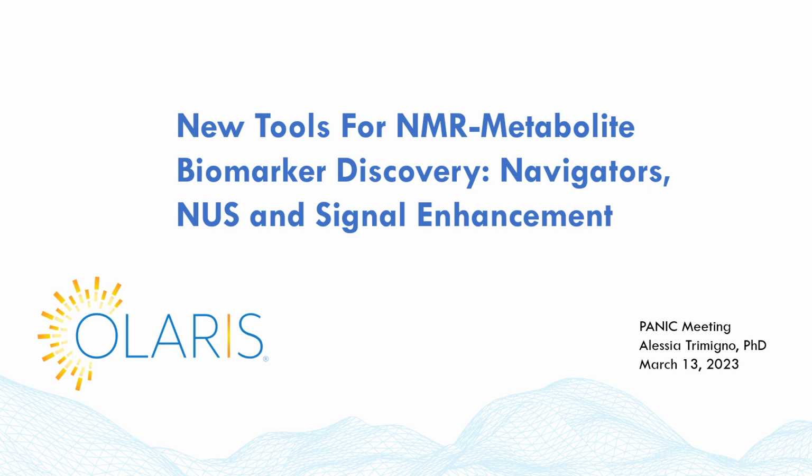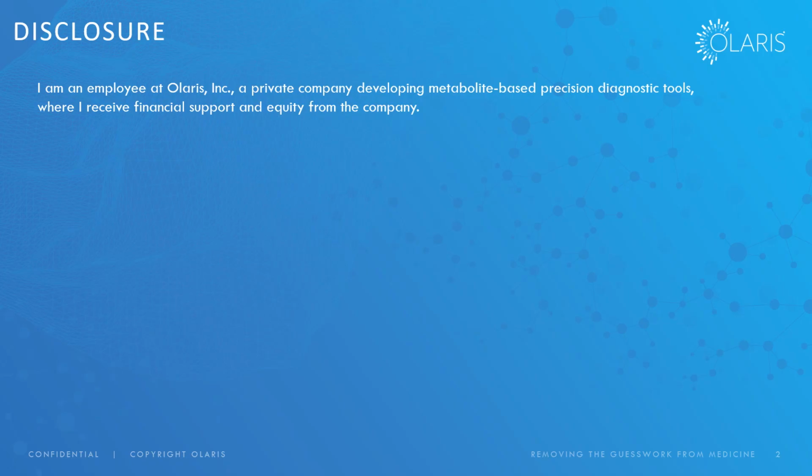Today, I want to talk to you all about new tools for NMR-Metabolite Biomarker discovery, which are Navigators, NUS, and Signal Enhancement. My name is Alessia, and just as a disclaimer, I work at Olaris, which is a private company from which I get both financial support and equity.